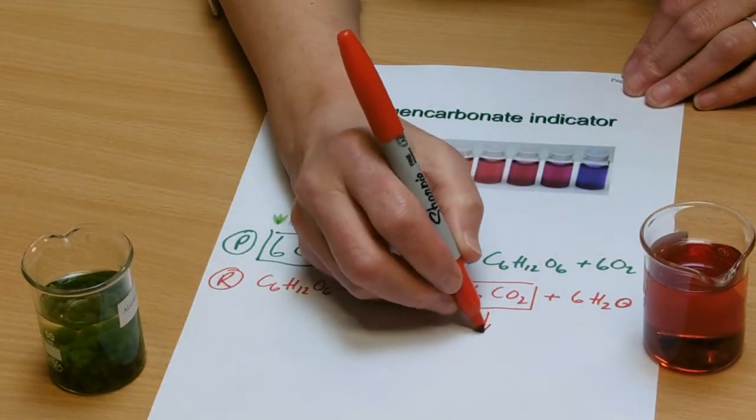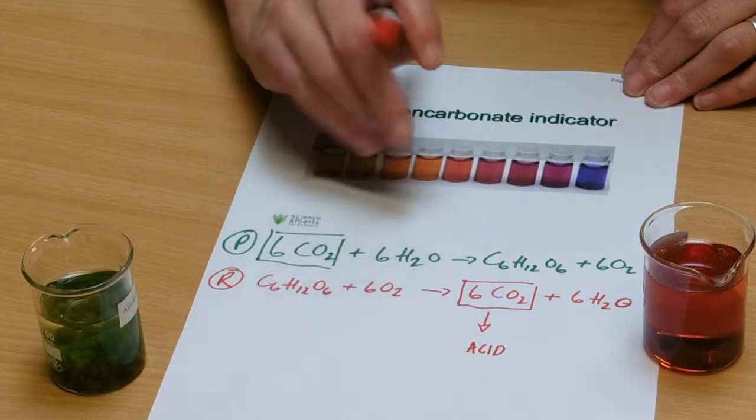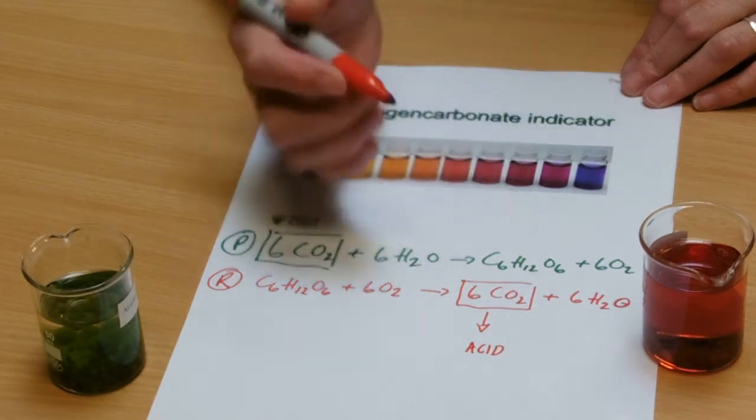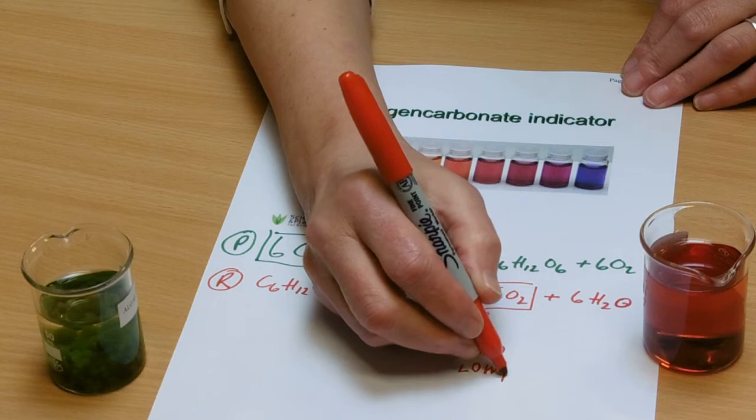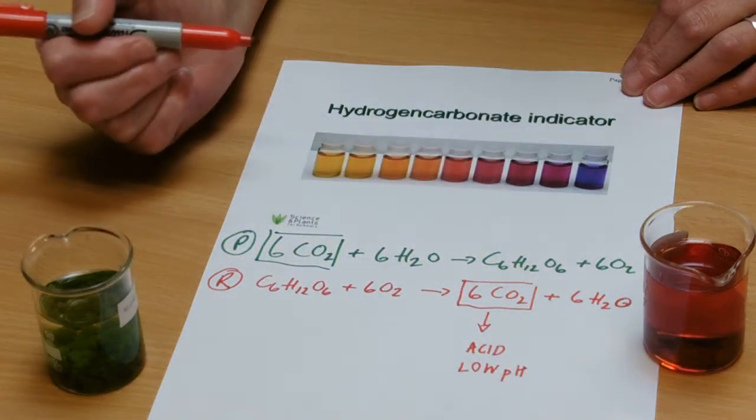So what do we know about carbon dioxide? From your working on animal transport, you will know that carbon dioxide is an acidic thing. So it's going to make a low pH, which is going to change the color of the indicator.